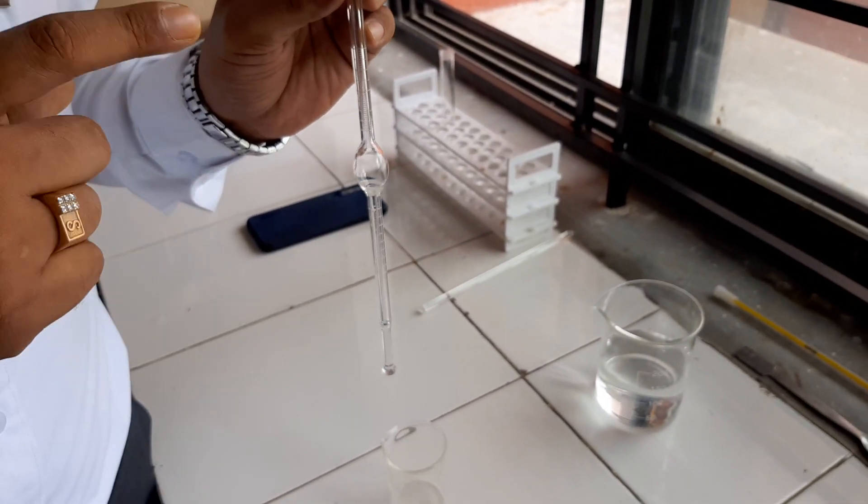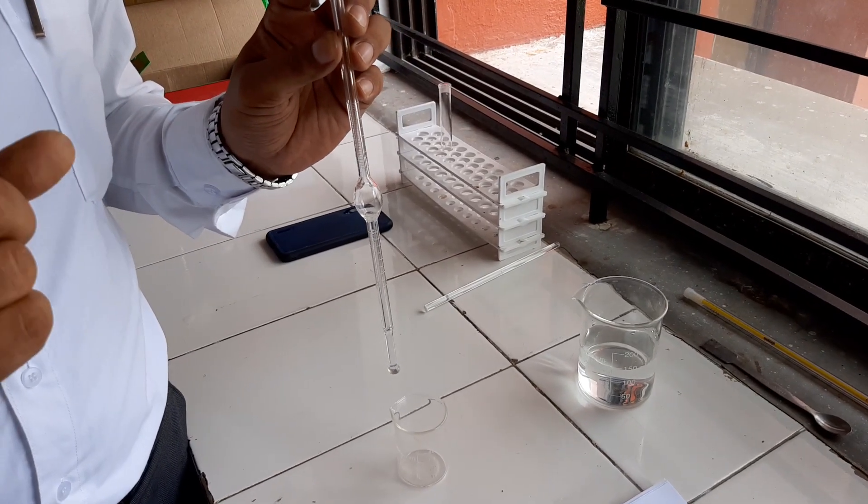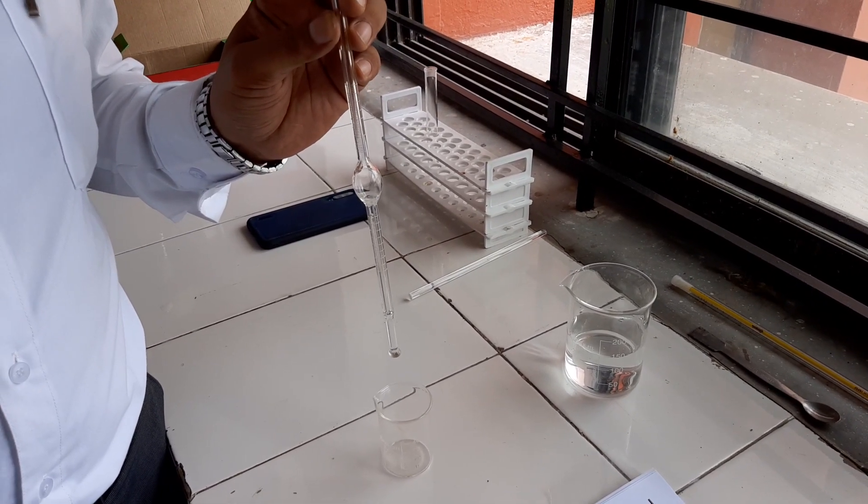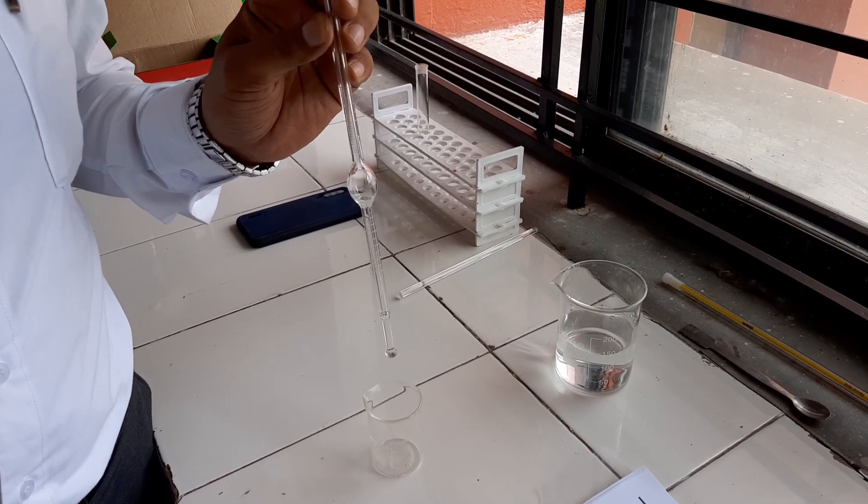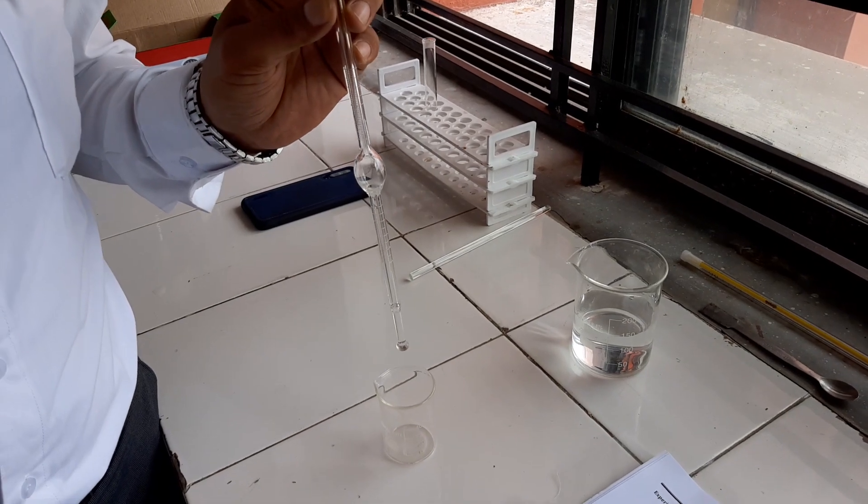So, in drop weight method, you have to take the total weight of drops. In drop count method, you have counted the number of drops. But here, you have to take the weight of liquid.